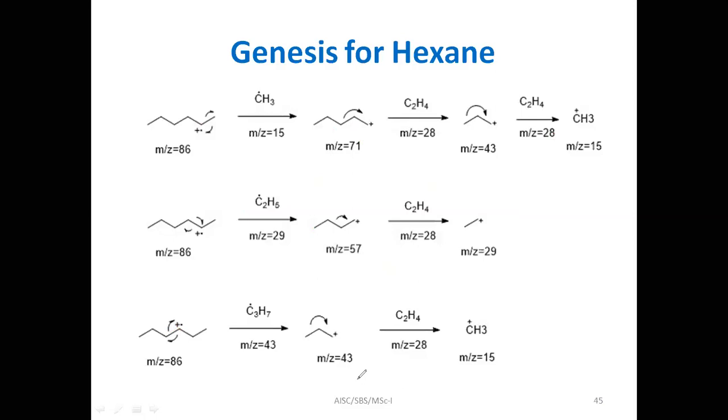Where is this hexane used? Yes, anyone? This hexane is used where? As a solvent. As a solvent where? So TLC. In TLC you use that hexane. So that is the fragmentation of hexane here. Okay, next slide.